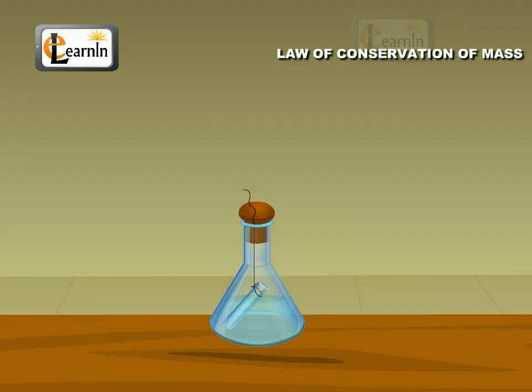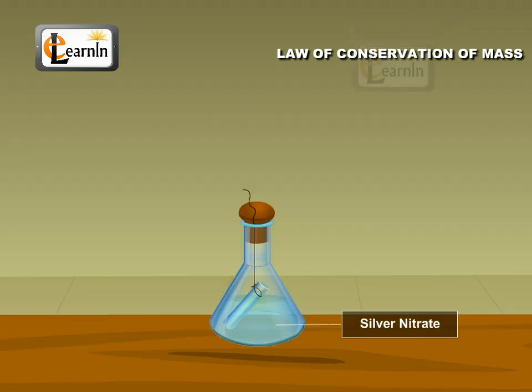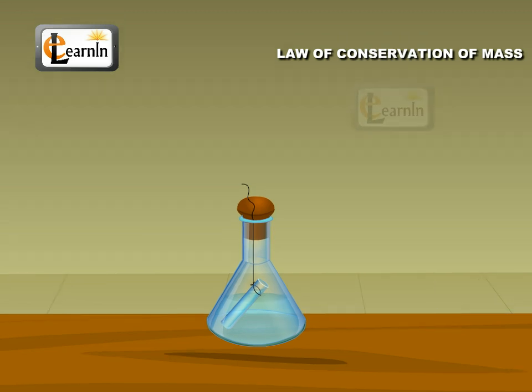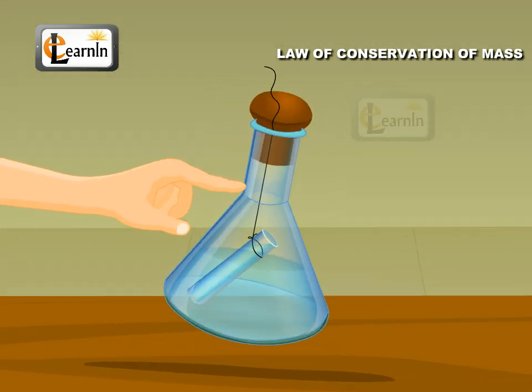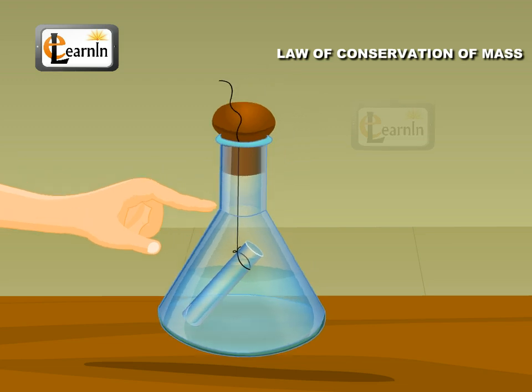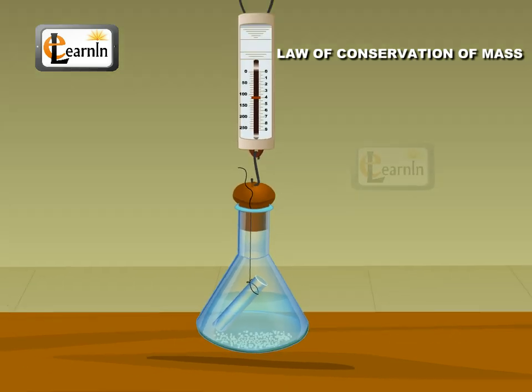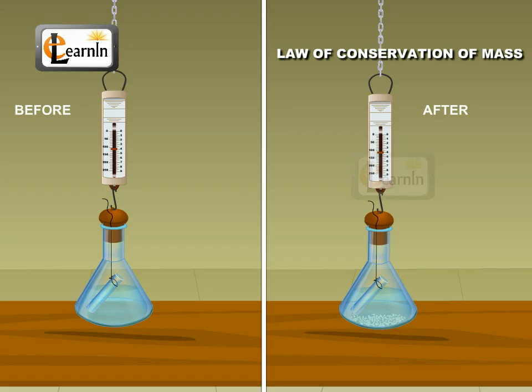The same reaction is repeated using silver nitrate solution in a conical flask and sodium chloride in a test tube. Again, a white precipitate is formed after mixing these solutions. In this case, there is also no change in the weight before and after the reaction.